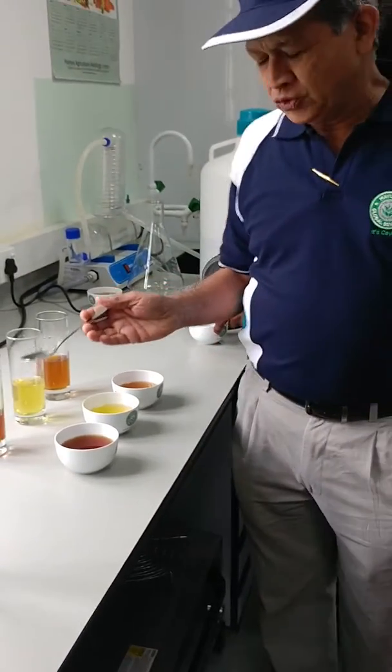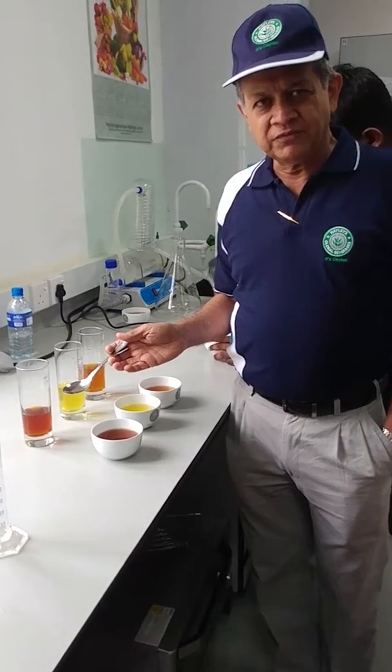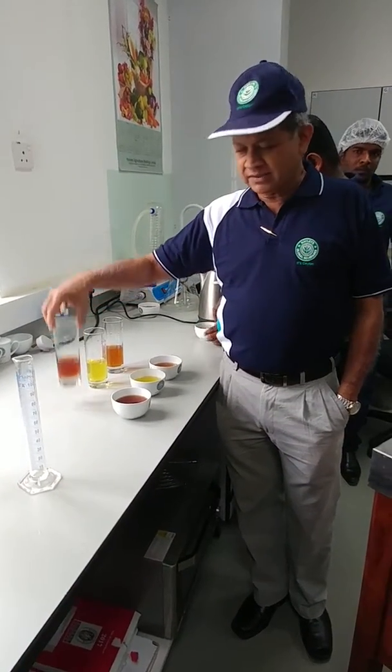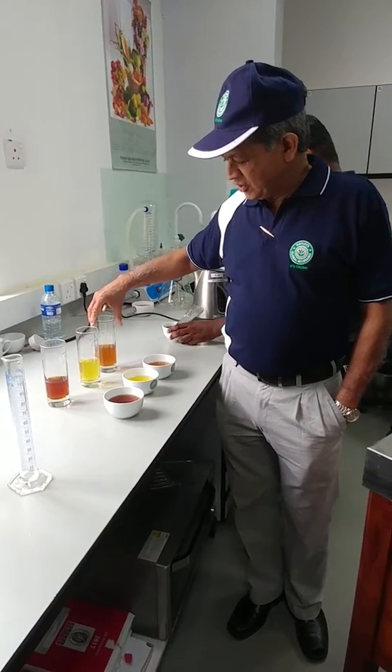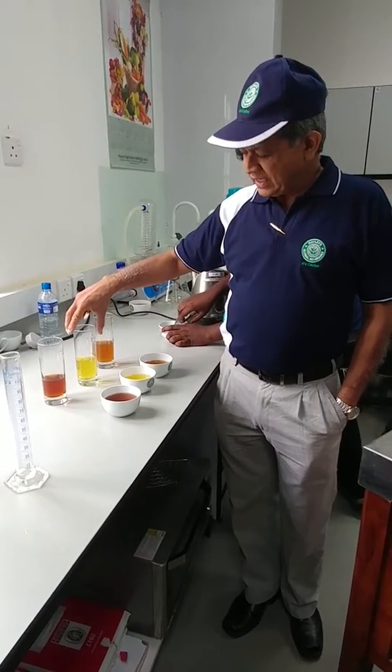What we do here is 2 grams of the powder with 100 ml of water. What you see here is the hot water soluble, and the cold water soluble is this one — the same dosage — and likewise in green tea.